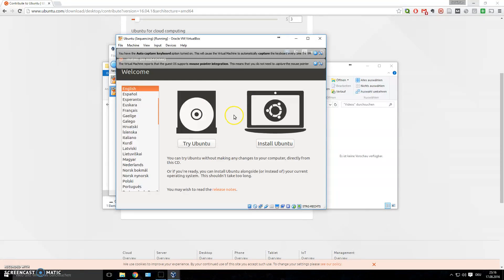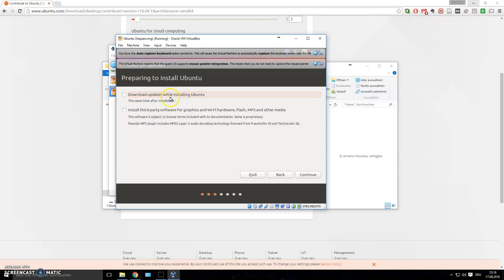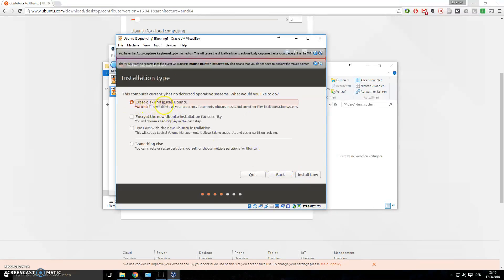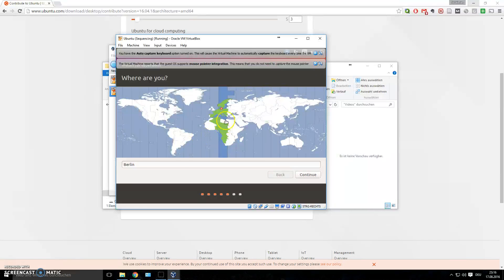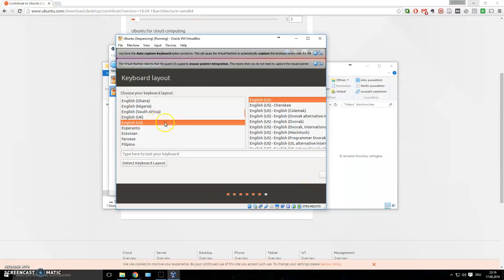You'll arrive at the welcome page. Choose your language — stick with English so it's easier to follow tutorials. Click 'Install Ubuntu' rather than 'Try Ubuntu.' I recommend checking 'Download updates while installing Ubuntu' to save time. On the next screen, choose 'Erase disk and install Ubuntu' — don't worry, this only erases the virtual disk, not your actual files. Click Continue.